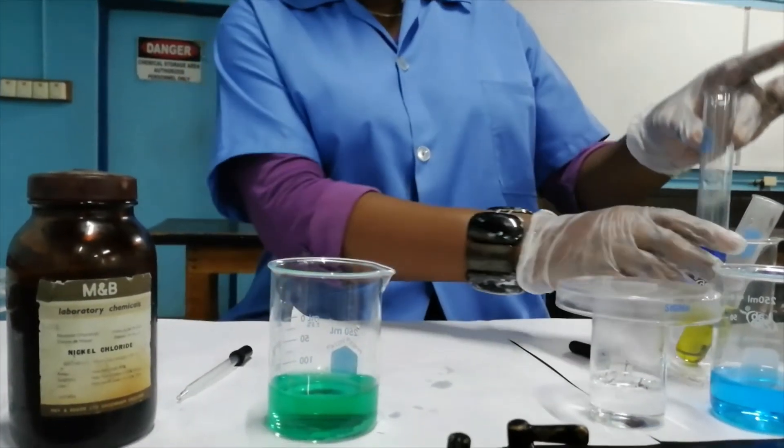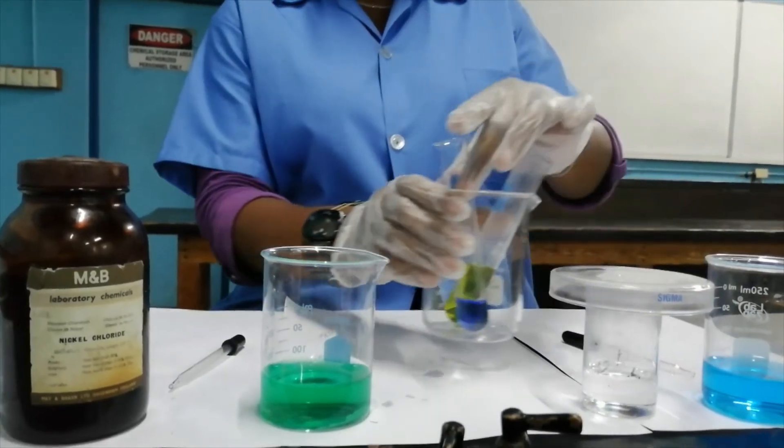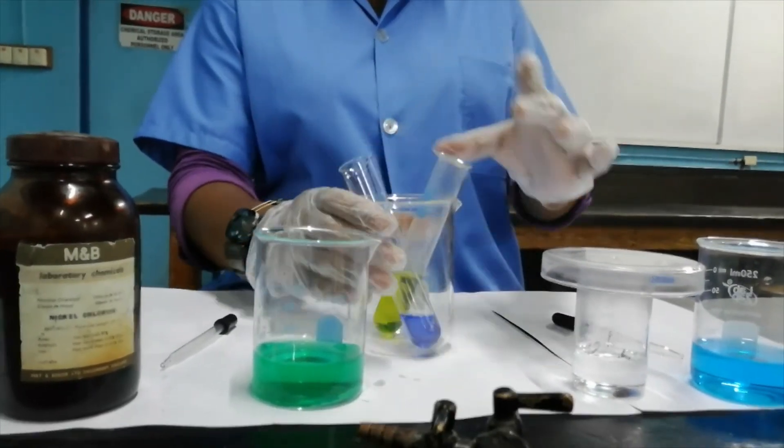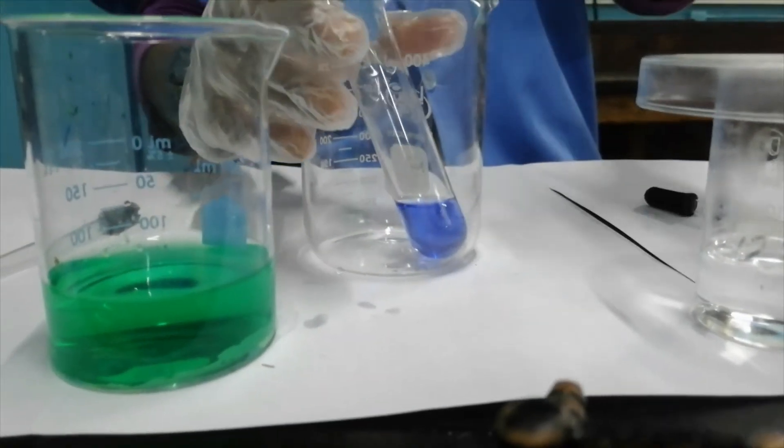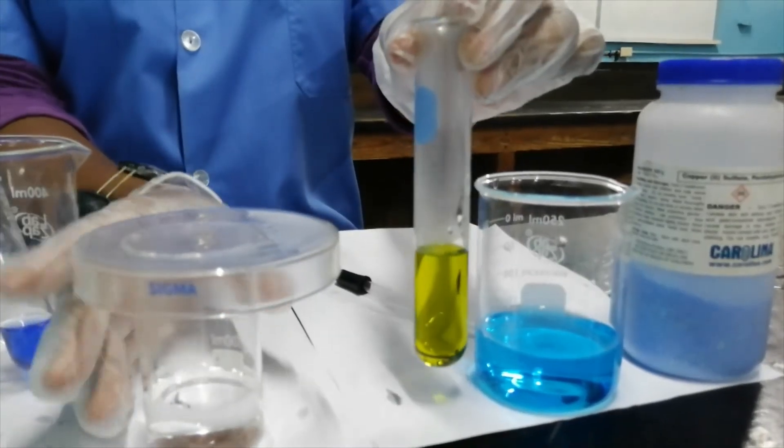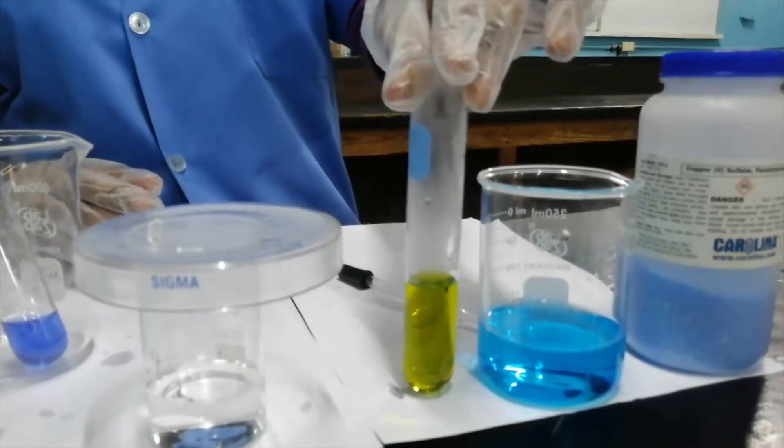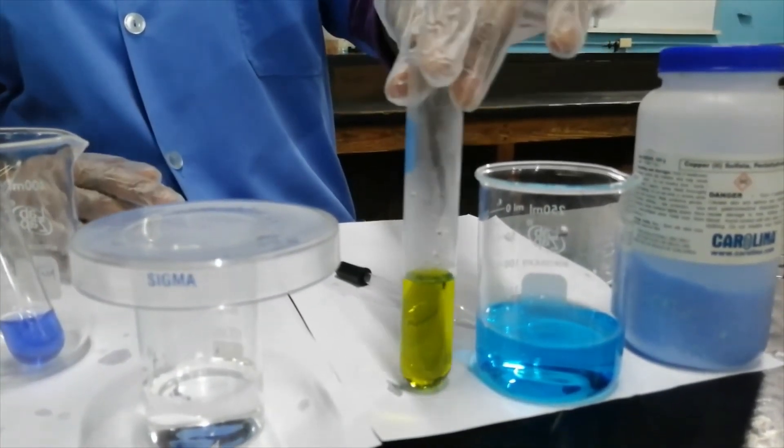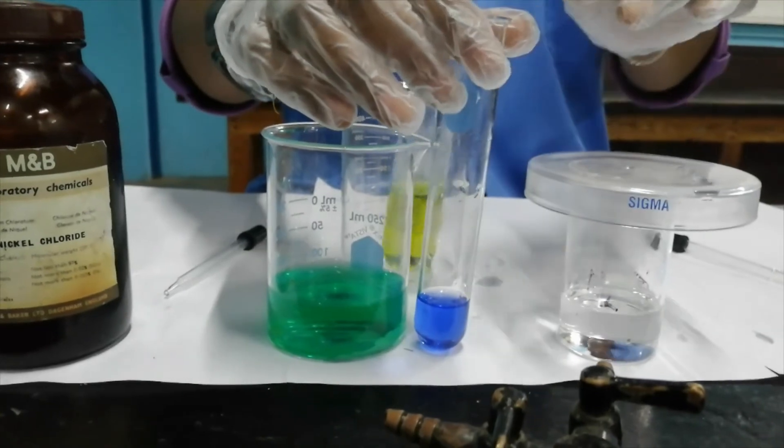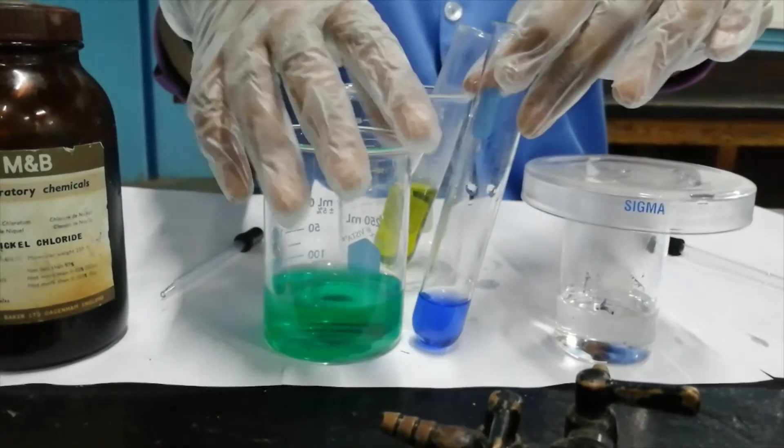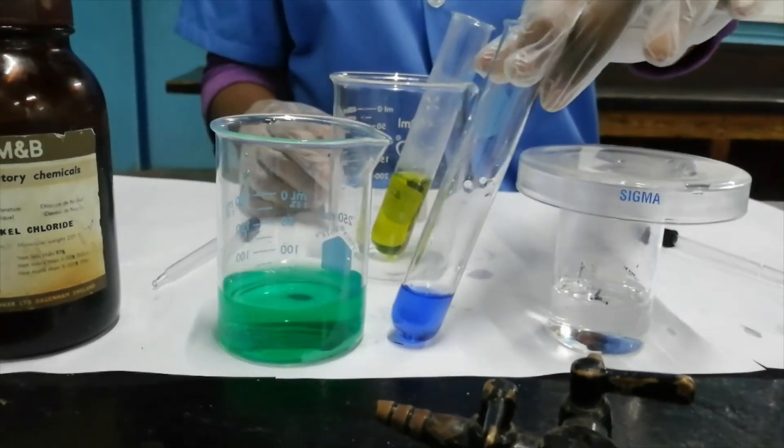Please take note of the colors of the solutions before, during, and after the experiment. To summarize now, the copper sulfate solution, when you added the concentrated hydrochloric acid to it, it moved from blue to green to yellow. With the nickel II chloride solution, when we added the concentrated aqueous ammonia to it, it moved from green to blue.